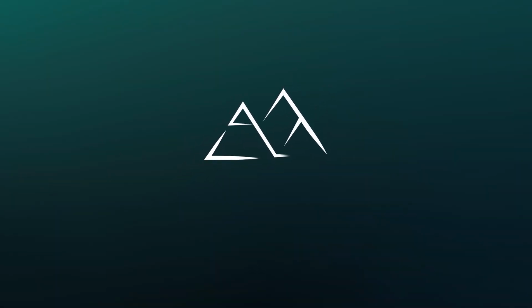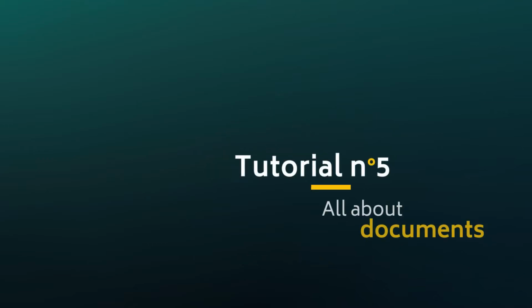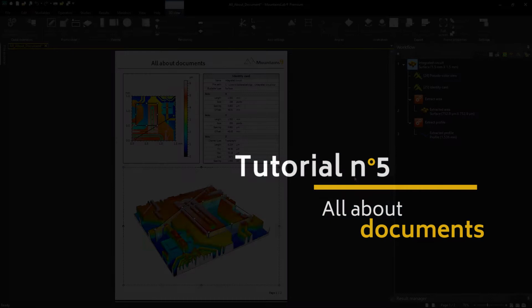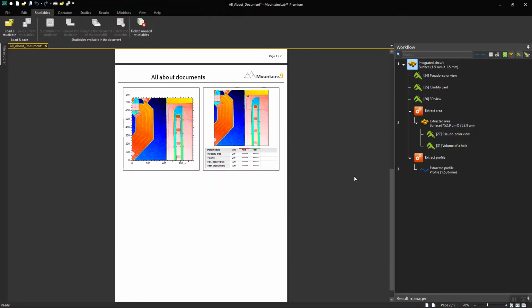Hello, and welcome to the 5th video in this tutorial series on Mountains, Digital Surf's industry standard software for profiler and microscope data analysis. In this video, we're going to take a closer look at the Mountains document and learn how to customize it. In Mountains, the document refers to the pages which you can generate and edit studies on.